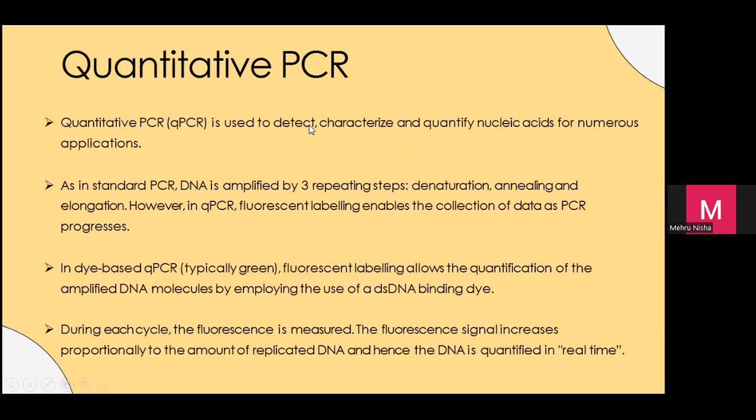Dalam semua PCR yang I ajar ni, the top is still qPCR. Okay. The bezanya, yang ni you guna machine and result dia akan keluar di screen. Akan dipaparkan di screen. Oh, berapa dah naik amplicon dia and so on. We have one unit dekat our university also.